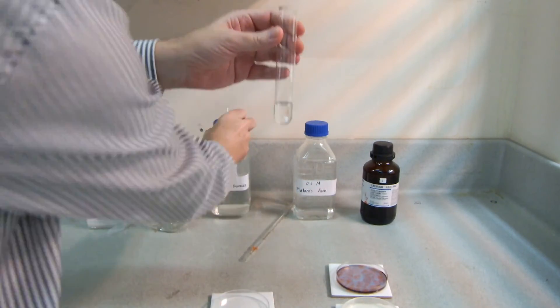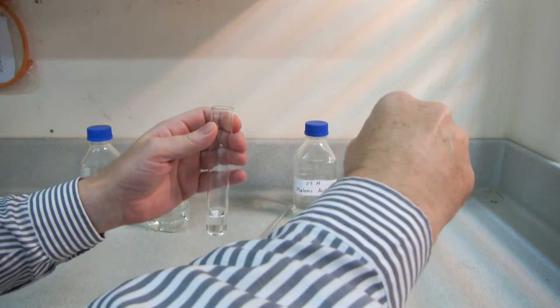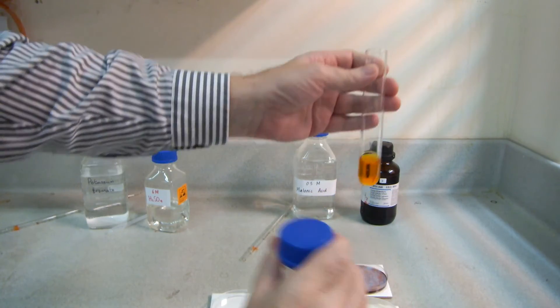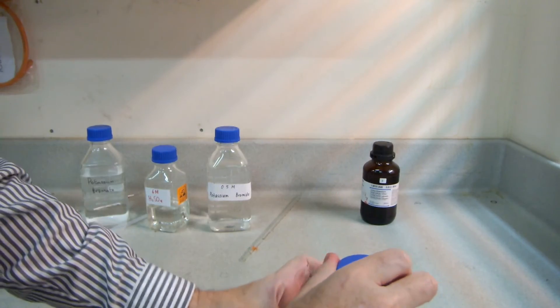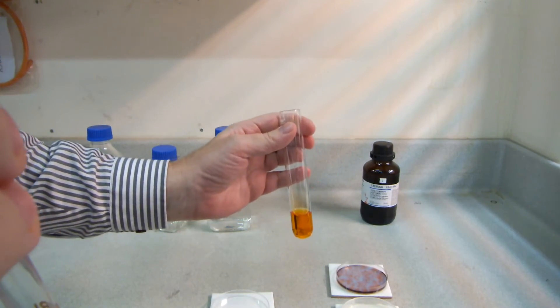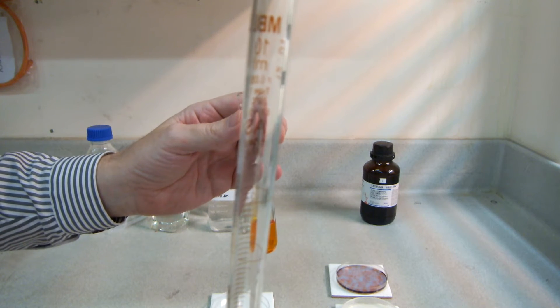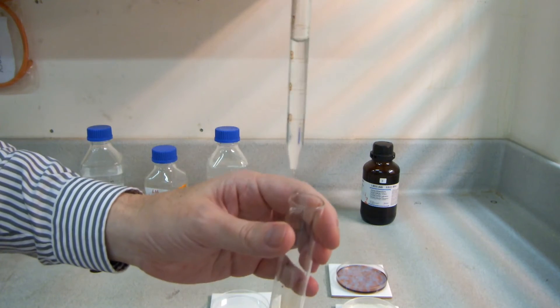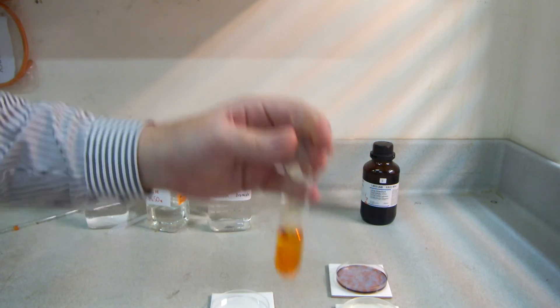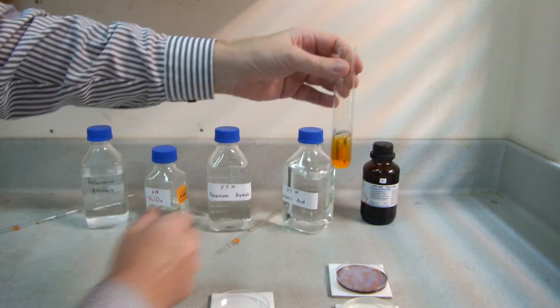Next comes potassium bromide — 1 cm³ — and this you want to do as quickly as possible because it starts to generate some bromine, which is not pleasant. So there, 1 cm³ in it goes, and you'll see immediately the orange colour of the bromine being developed. And in order to counter that, we want 2.5 cm³ of malonic acid. That's as quickly as we can — 2.5 cm³ of malonic acid.